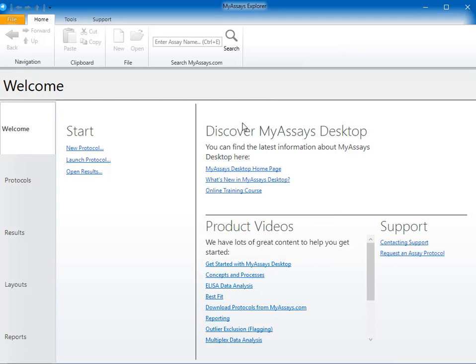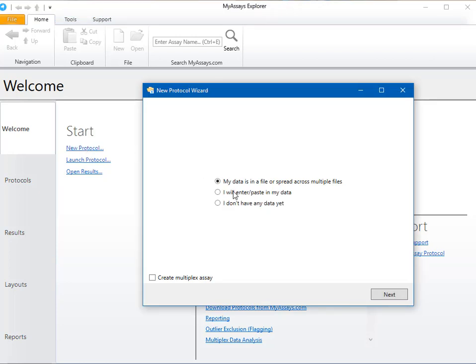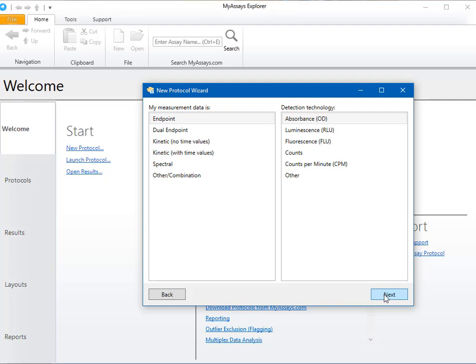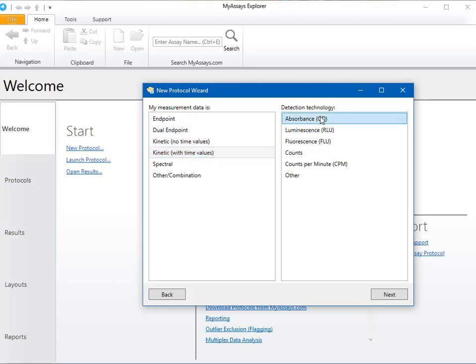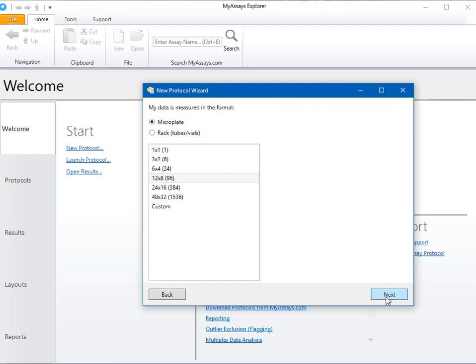Within the My Assays Desktop Explorer, I'll create a new protocol using the New Protocol wizard. I'll select the I will enter or paste in my data option. Next we can select what type of data we will be analyzing. I'll select Kinetic with time values, and the detection technology is absorbance. Here we can specify our data format, and in this case, I'll select the 12x8 96-well microplate.